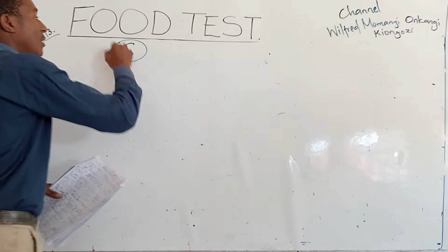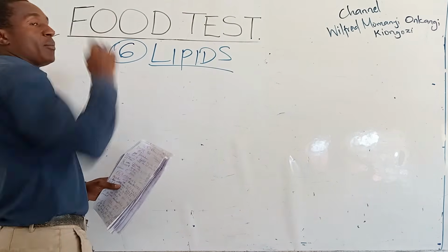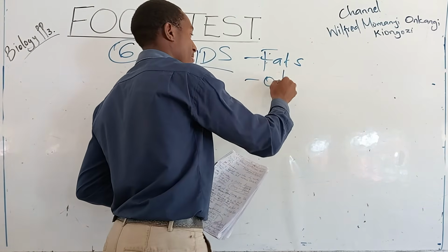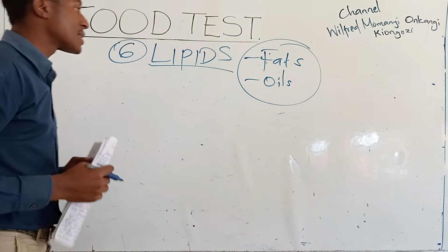Number 6. Lipids. Lipids can be fats, can also be oils. And now, we don't have chemical tests for this.